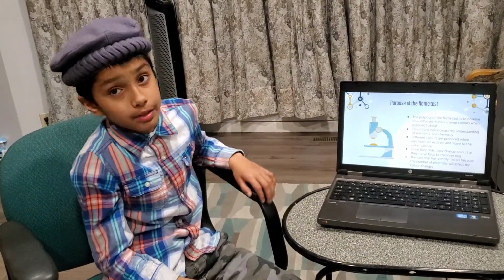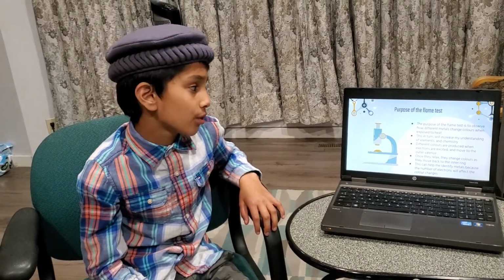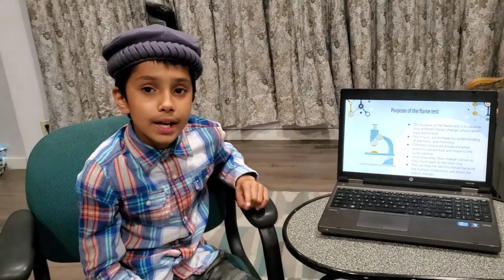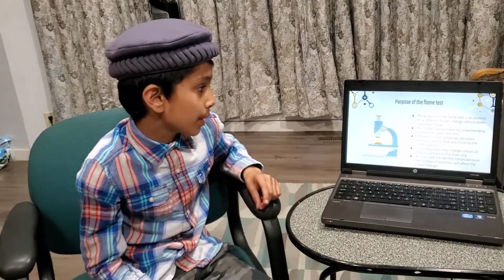Purpose of the flame test. The purpose of the flame test is to observe how different metals change colors when exposed to heat. Then this will increase my knowledge in the study of elements and chemistry.